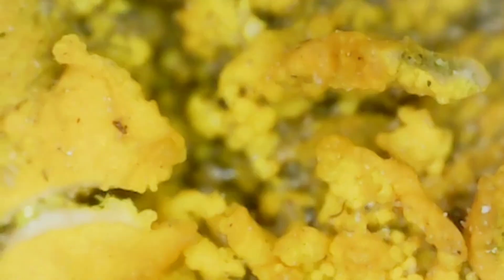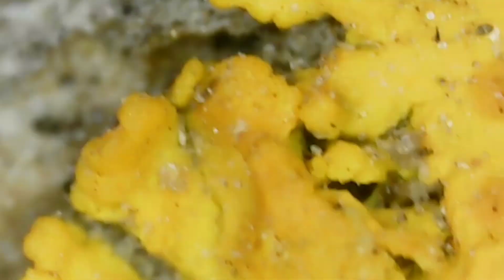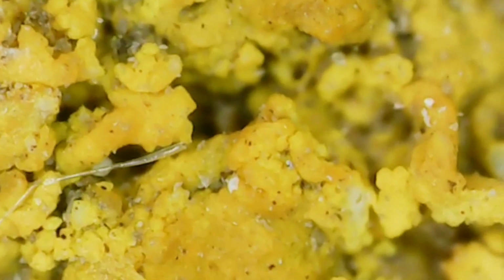Let's see, I notice how there are parts of the lichen community that are green, and other parts that are yellowish to darkish brown. Not knowing a lot about lichen communities, lichenology is a whole field, I wonder if we're actually seeing the different species that make up this community, the algae perhaps being the green, and the darker yellowish honeyish bits being the fungi.